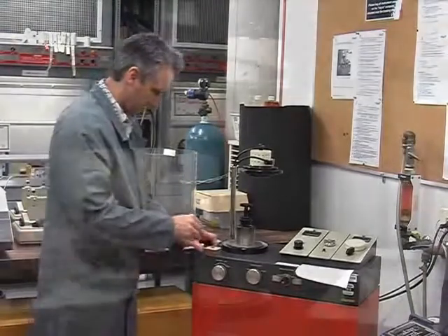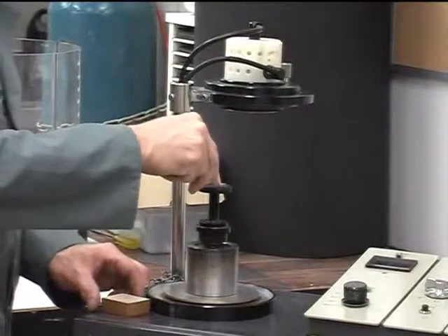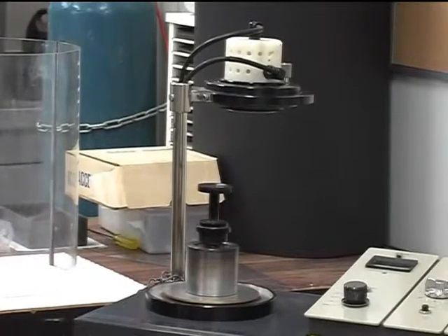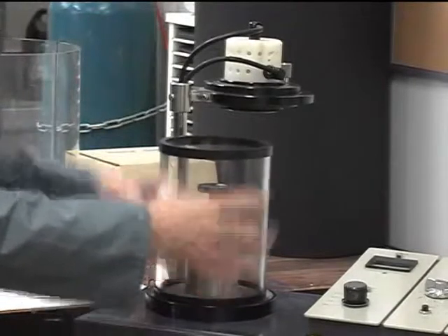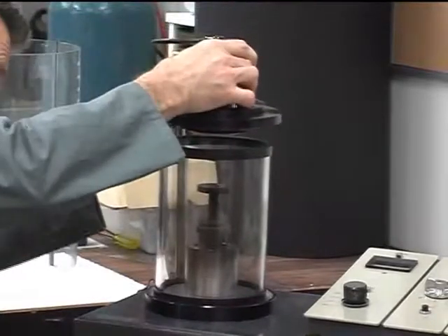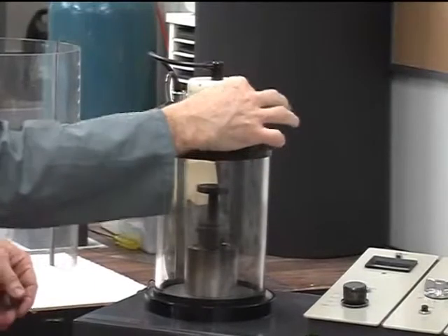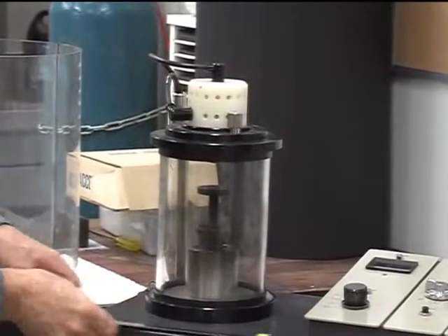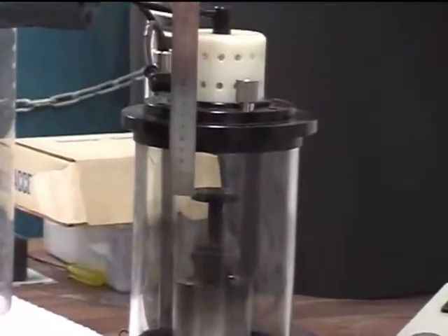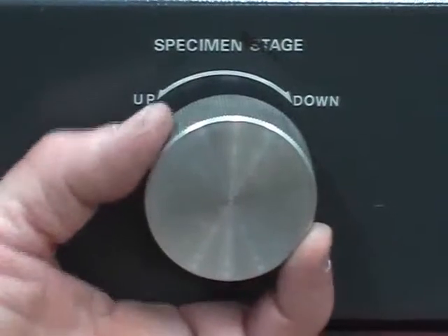Using a pair of stub forceps, load the sample holder with a specimen or specimens. Replace the glass chamber, check the top seal is in place and gently lower the black lid. Check that a good seal is made before gently tightening the vent valve. Measure the distance between the top of the specimen and the bottom of the platinum target, and use the knob to adjust the specimen stage so that the distance is 50 millimetres.